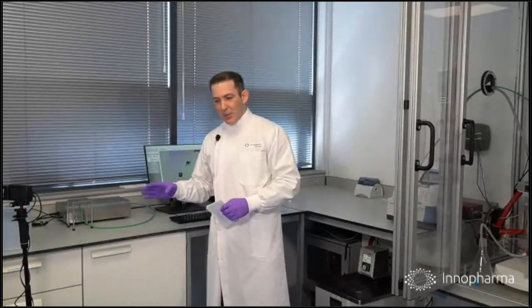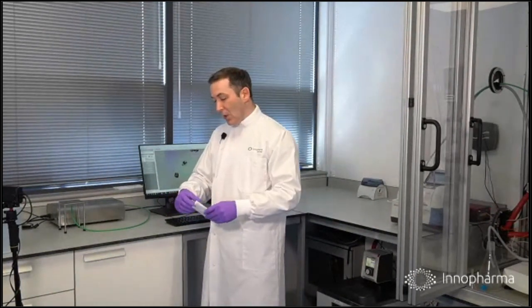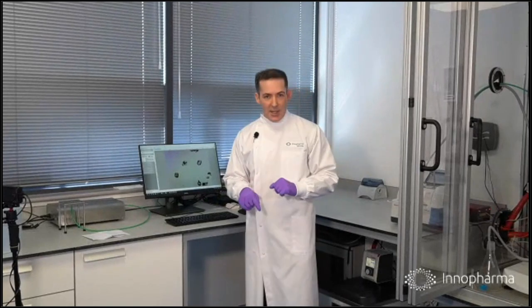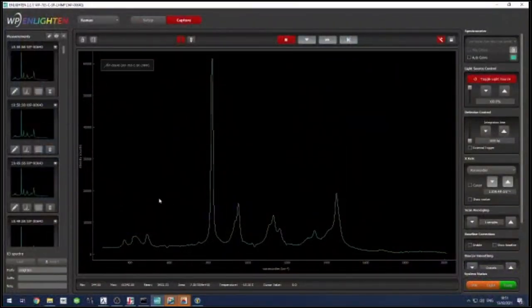So what we've seen is the consequence of allowing the reaction to proceed in an uncontrolled way. And I hope that alone is enough to justify controlling the reaction, controlling things slowly. But what we would really need is a method, as I said, of looking into the process to see how it's progressing in real time. So for that, we need to look at the sensor data. So I'm going to switch back again to show you what the sensors are seeing at the moment. We'll see what the Raman sensor is seeing, and it sees a spectrum.